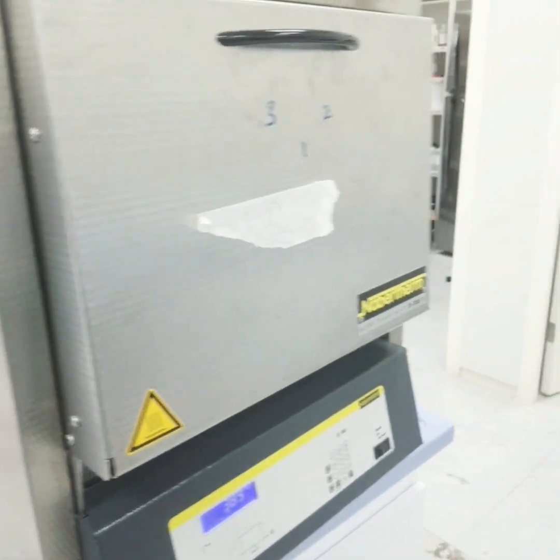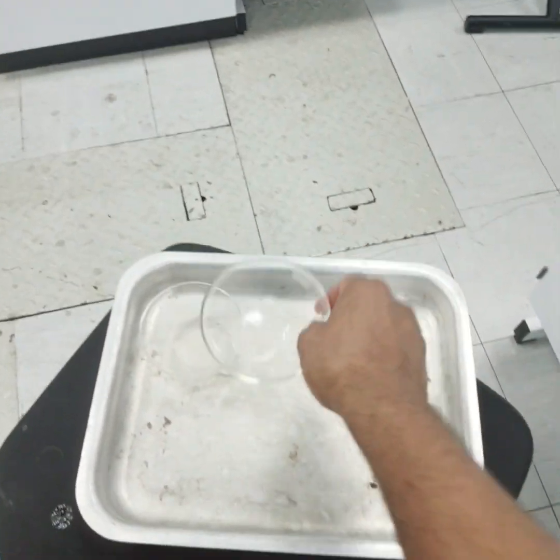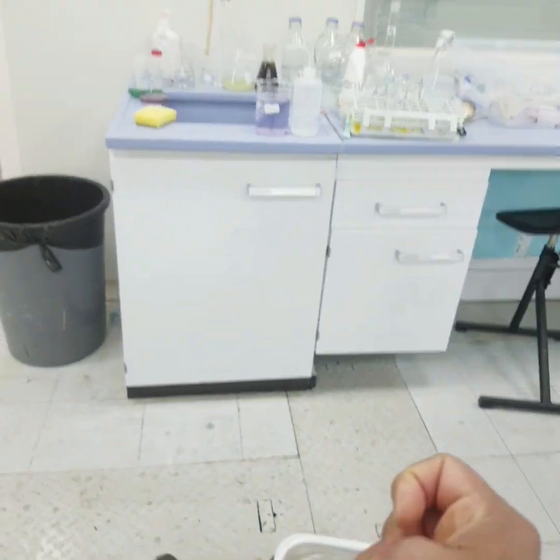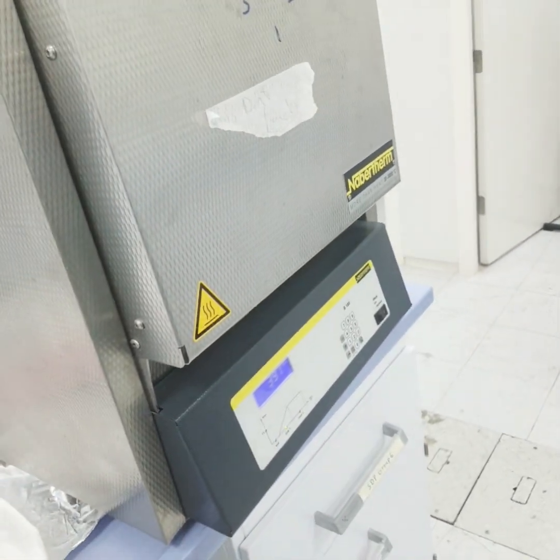We have to take around 2 grams of the sample in a crucible like the one we have here, and we will be taking around 2 crucibles. You can take 3 or 4, in which case you will minimize the error. Okay, so let's start the procedure.